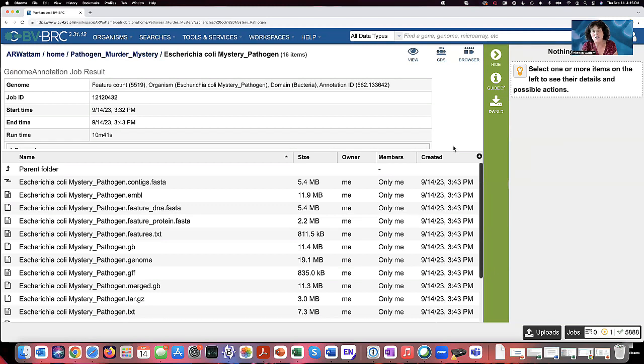Also, this genome, which is my private data, and if you weren't looking at my screen and you were logged in, you could never see it. That is in the resource. So I can use it to make trees and things like that. I can include it in those things where I can't if it's outside of the resource.